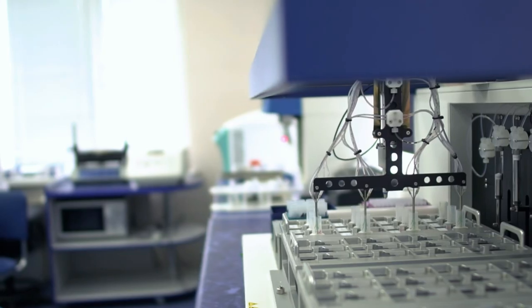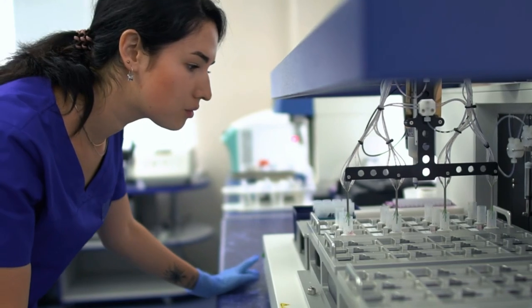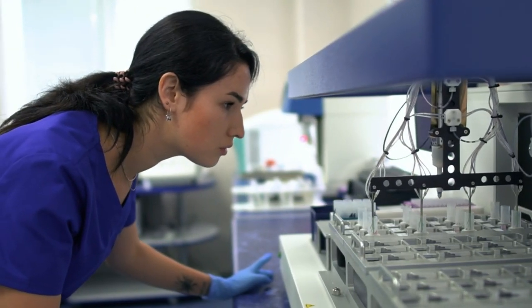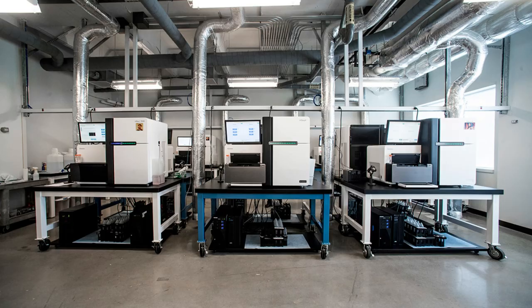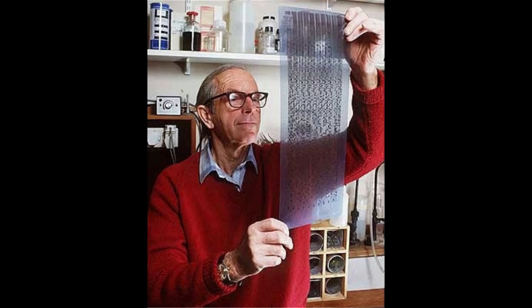To start, I think it would be helpful to gain a brief understanding of the sequencing technology widely used in DNA barcoding. It's called Sanger Sequencing, and it's named after its creator, Frederick Sanger, who developed the technology with his team in 1977.